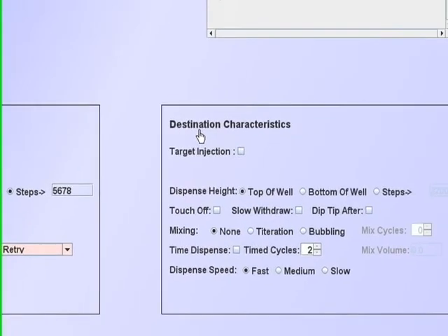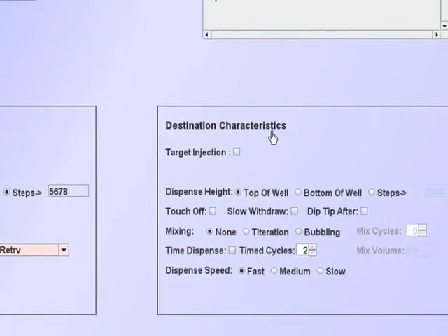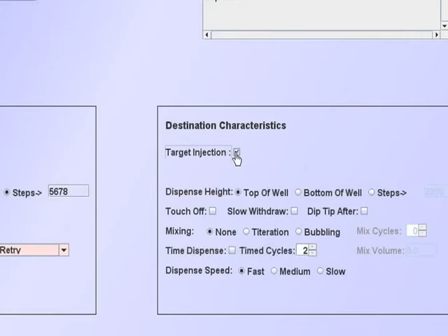The destination characteristics define the dispense function. If target injection is selected, it overrides other functions. The tip will use piston displacement to dispense all but the last 3 microliters at the top of the well. It will then use low air pressure to blow out the last 3 microliters.